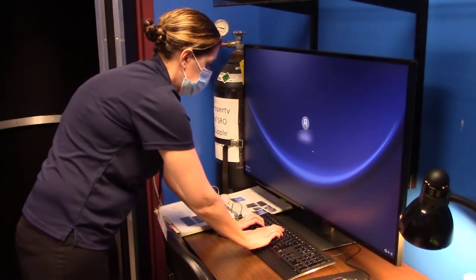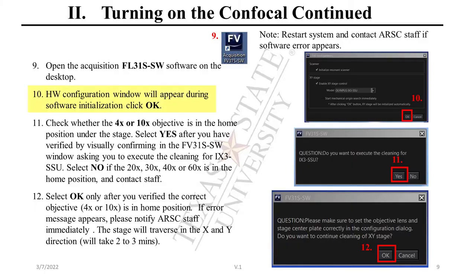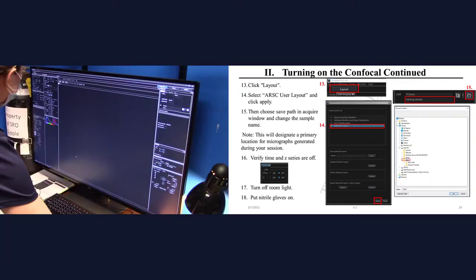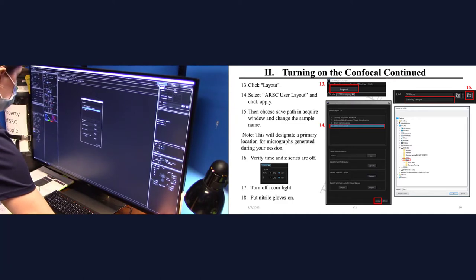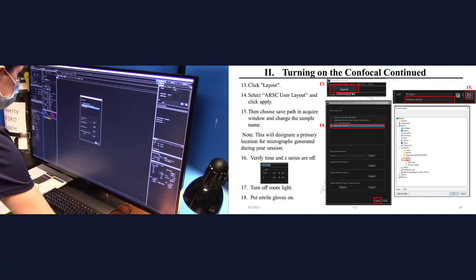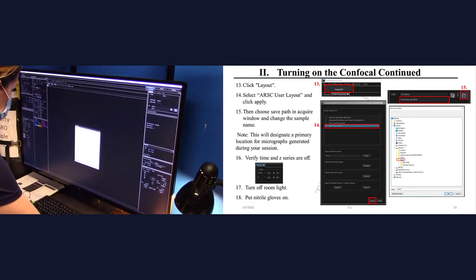Turn on the computer. Click on the main screen and enter the password. Next, open up the software. Click OK on the HW configuration pop-up window. If the 4X or 10X objective is in the home position, then execute the cleaning of the stage. Select Layout, then ARSC User Layout, and click Apply. Choose the save path for your images and name your future micrograph.